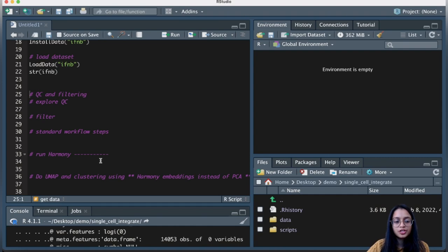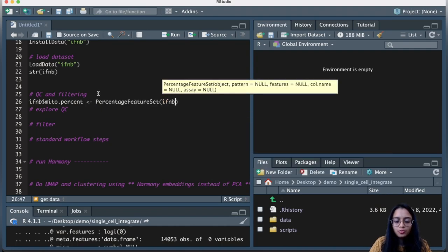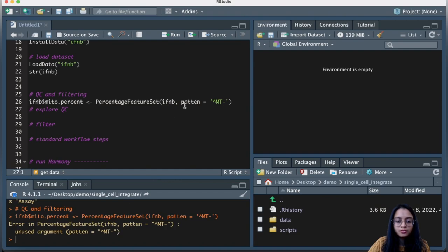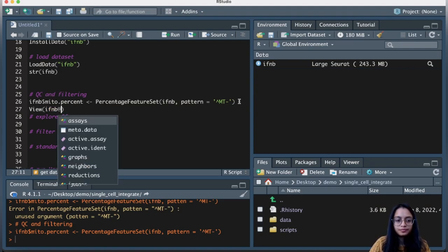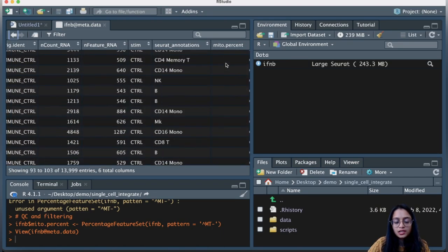We perform all standard workflow steps including QC, filtering, and processing, first visualizing whether the data separates by condition, then running Harmony to integrate. Let's start by calculating the mitochondrial read percentage for each cell. We assign a new variable mito.percent using PercentageFeatureSet, providing the object name and the pattern starting with 'MT'. Looking at the metadata, most cells have very low or no mitochondrial reads.